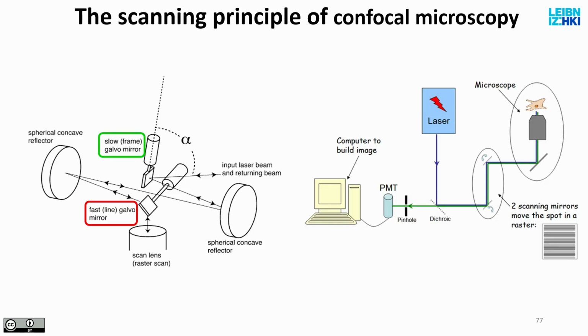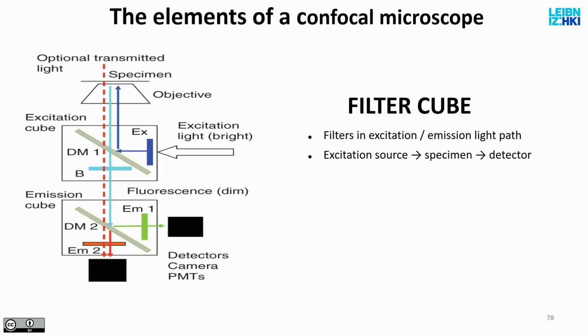So you would either have a camera but leave the shutter open the whole time until the microscope scans through the entire sample and then collects a lot of noise. Or you use a detector which is not a camera but a so-called photomultiplier. The photomultiplier tube detects photons from a very small spot focused by a lens that sits in front of it. I'll show you an example in a minute.